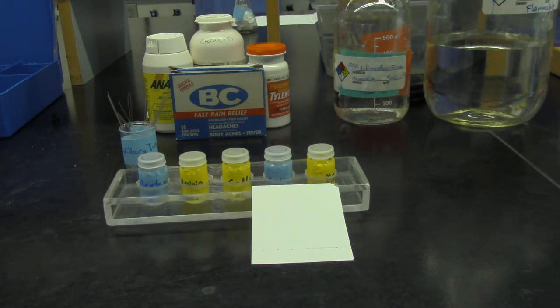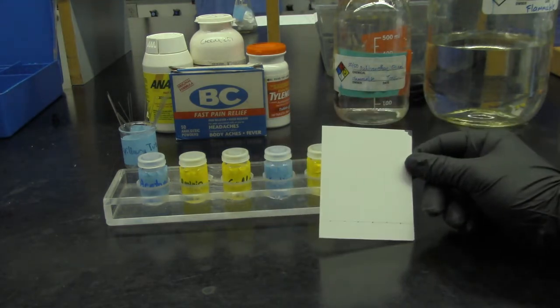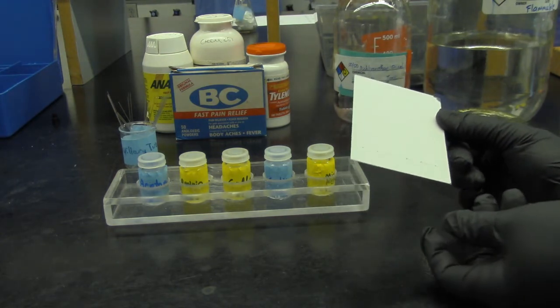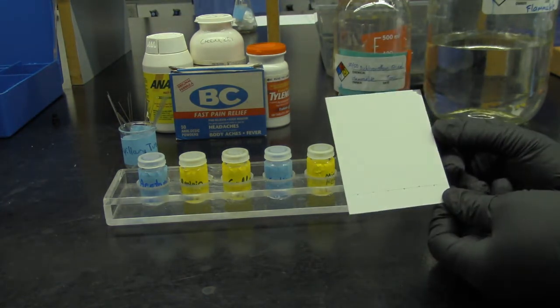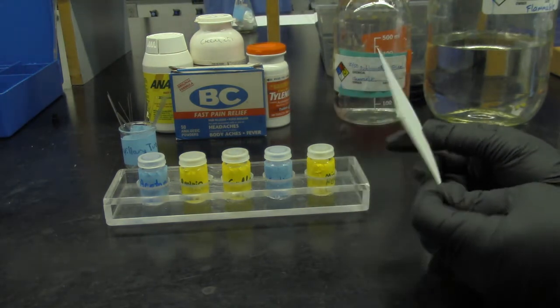So we're doing thin layer chromatography, and chromatography is a technique we use for separating mixtures into their constituent parts. It relies on the different properties of compounds interacting with the stationary phase. The most commonly used in chromatography is TLC, thin layer chromatography.